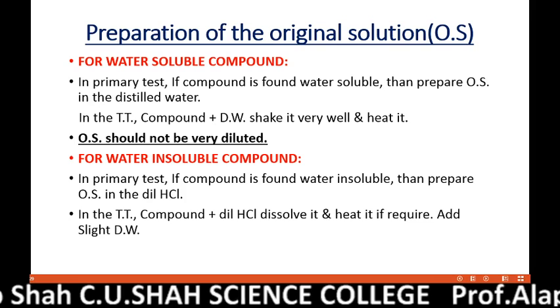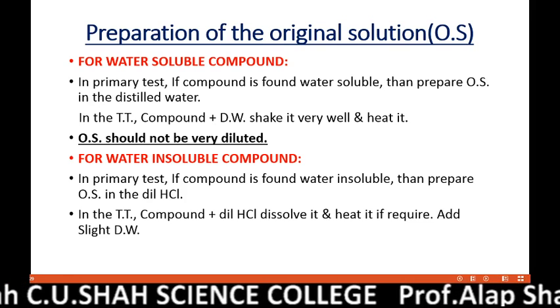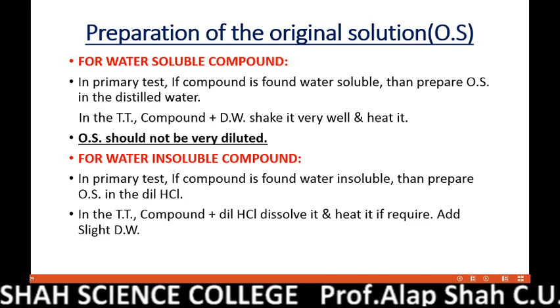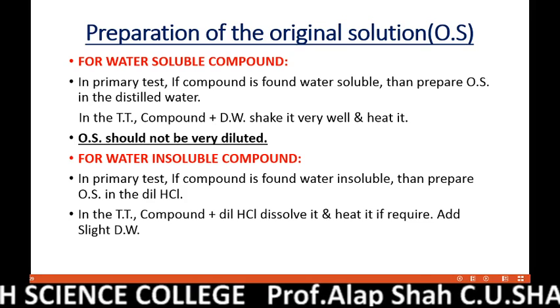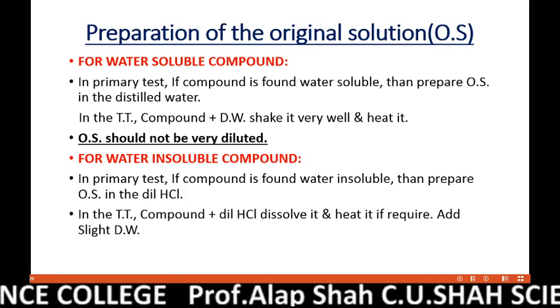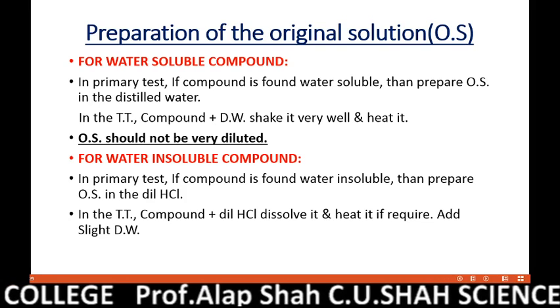The only thing you should take care of is that your original solution shouldn't be very diluted. It means that you should take a considerable amount of the compound and proportionately the required amount of water. But if you take more water than required, then obviously your OS will be diluted. In that case, you may not get the proper test.